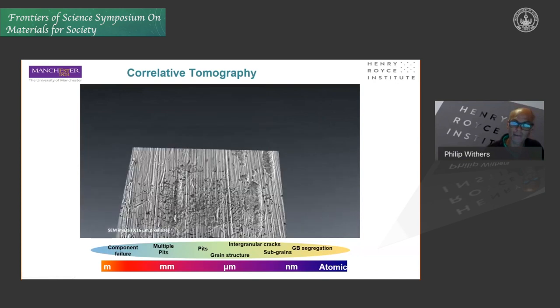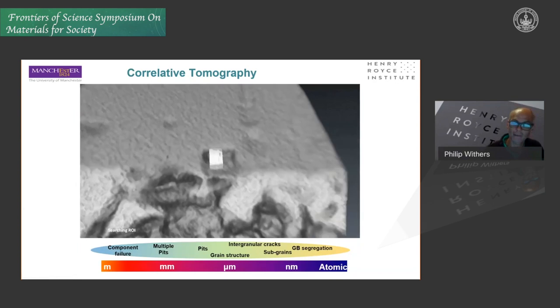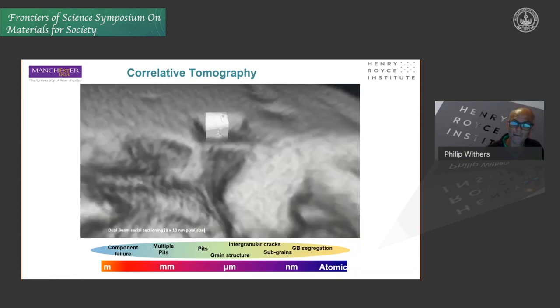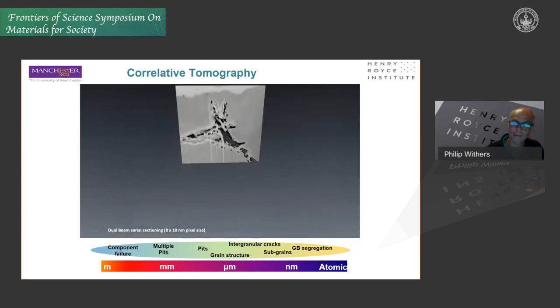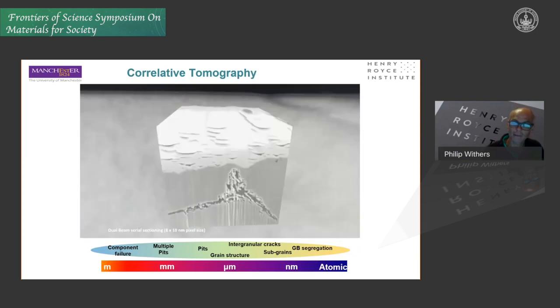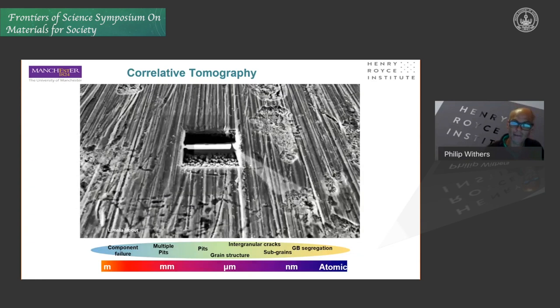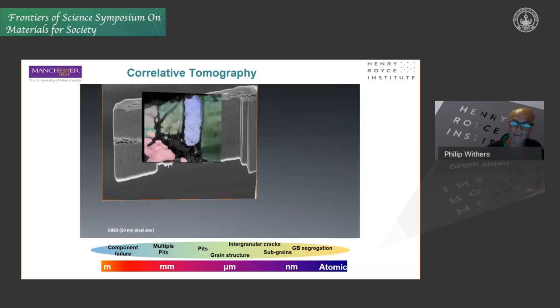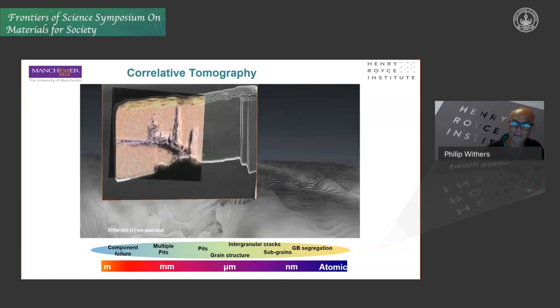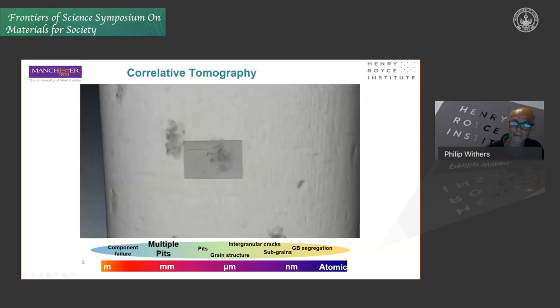And then we can identify that region and look at perhaps the front of the crack to understand, well, what's going on at that corrosion front by using scanning electron microscopy and cutting out that region using the FIB, as was described in that picture. So now we can study the corrosion at the grain scale, and then by using transmission electron microscopy and transmission Kikuchi diffraction, we can understand the nature of those grain boundaries, both in terms of the grain boundary relationships and the local chemistry, to understand why those grain boundaries are particularly prone or not prone to corrosion. So I think the key point here is by putting these length scales together, each one gives us a different opportunity to try and to control the corrosion process.